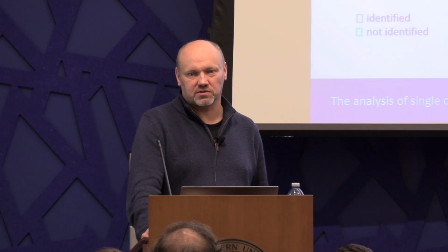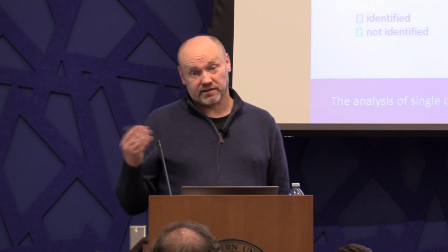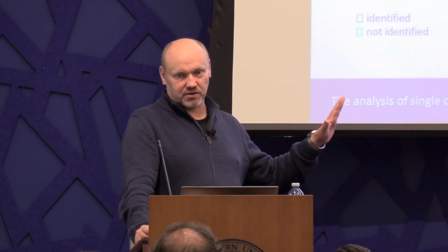Yeah, so actually at this stage, we just take everything. And then we have additional filters that would select. I mean, you could set a certain requirement on the co-isolation, at least the one that one can see on the MS1 level. One can use all kinds of filters in MaxQuant, but at this stage, we just try to get everything one can get.